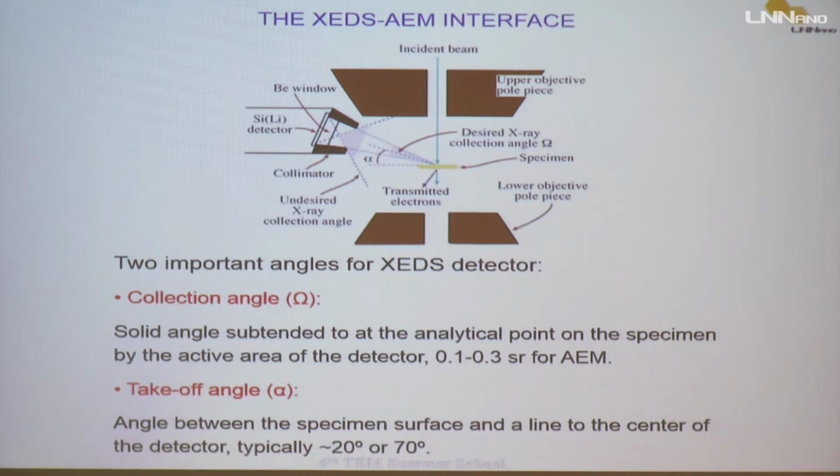The complete sphere is 4π steradians, which is about 12 to 13 steradians. In commercial instruments, you can acquire 0.1 or 0.3 steradians. And then you can have an idea of the amount of signal that you are throwing away during an experiment, okay? But I think it's clear to you why you have this problem. It's okay, it's clear?